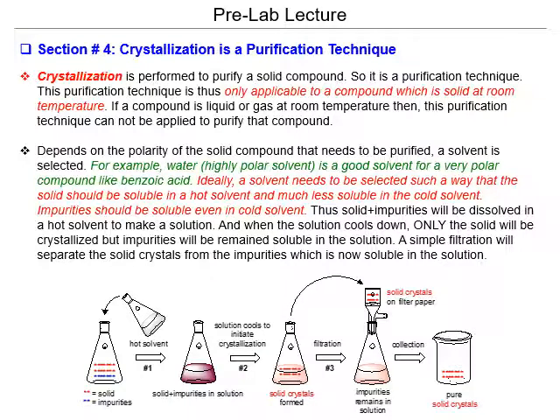Crystallization is definitely a purification technique, and it is performed to purify a solid compound. This is an important distinction, and it's only applicable to a compound that is solid at room temperature. If it's liquid or gas at room temperature, then it cannot be applied. You cannot crystallize the way we're going to be doing it, and you'll definitely see why, hopefully. But we have to select a solvent depending on the polarity of that solid compound. For example, water, a highly polar solvent, is a good solvent for a very polar compound like benzoic acid.